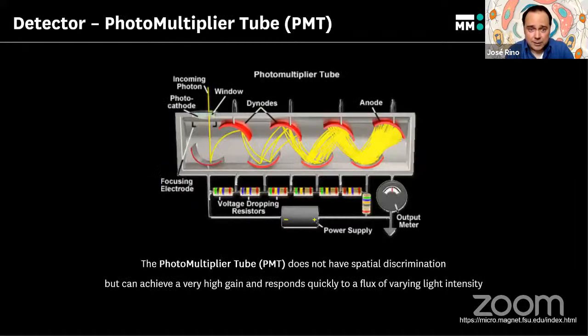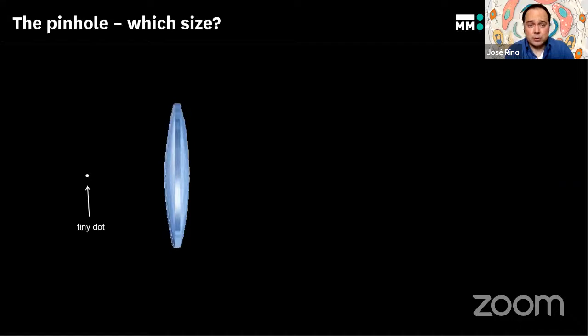All right. So what about the pinhole? What size should the pinhole be? What's the size of the opening? That's also something that we can control. And ideally, when you are doing confocal imaging, you tend to go for one Airy unit. Where does this come from?